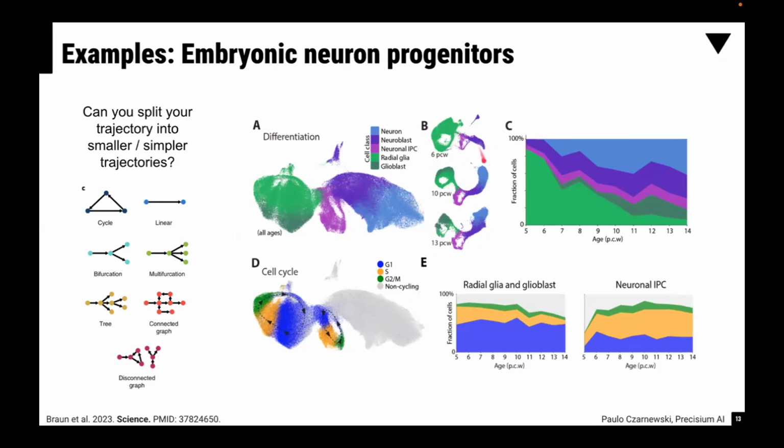So like this one has very few neurons, and that's perfectly fine. But then these cells here will just be aligned into this part of the graph because they all match. As long as you also have connecting cells in here, as you can see, you still have a few, they will always be part of that trajectory. So the harmonization and removal of batch effect does not affect that much your trajectories, and that's why you don't want to have batch effects in it as well.